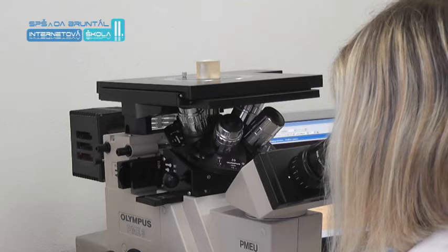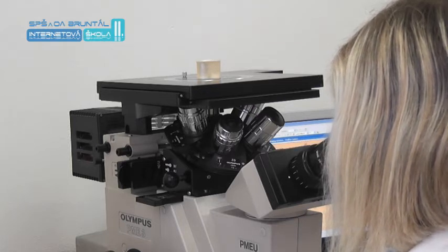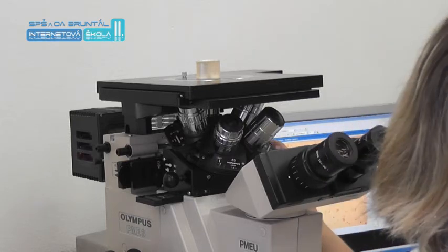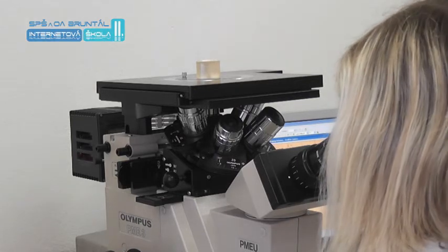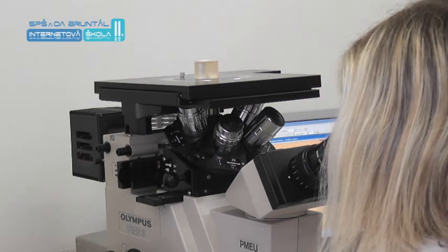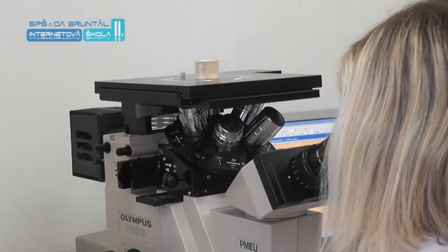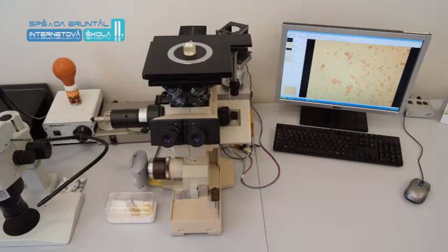The optical system of the metallographic microscope consists of an objective, eyepiece, auxiliary lenses, mirrors and prisms. The basic part of the microscope is the objective, which creates a magnified and inverted image of the studied structure. The objective consists of several lenses, because focusing with a simple lens is not perfect.